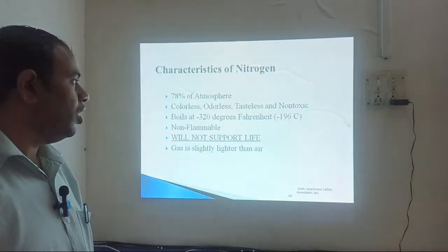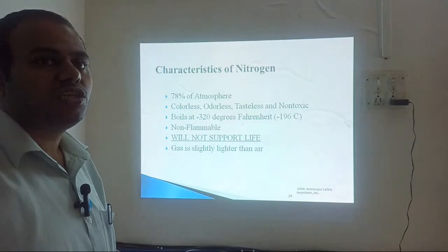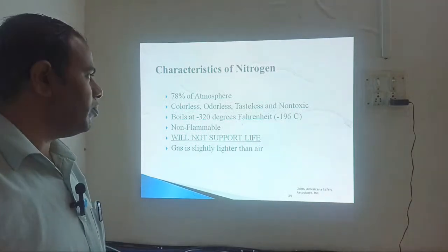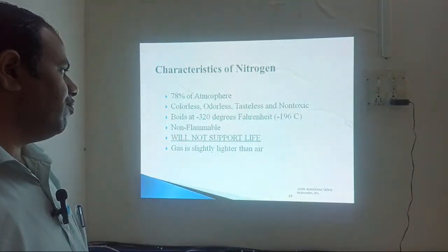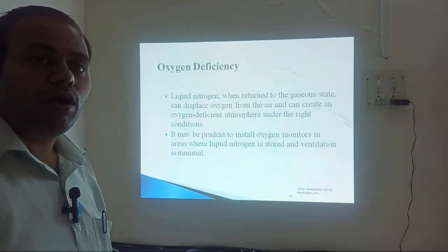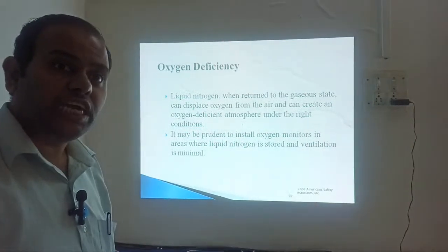Okay, one more characteristic of liquid nitrogen: it does not support combustion, that is, it does not support burning. It boils at minus 196 degrees. It is non-flammable, and it will not support life, and it is lighter than air. Okay, see, wherever liquid nitrogen storage is done, in that area there is an oxygen deficient atmosphere.